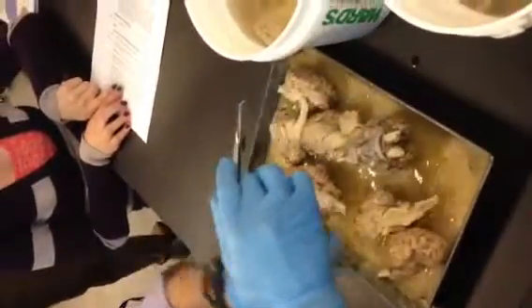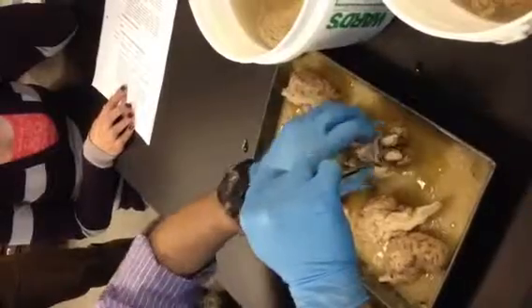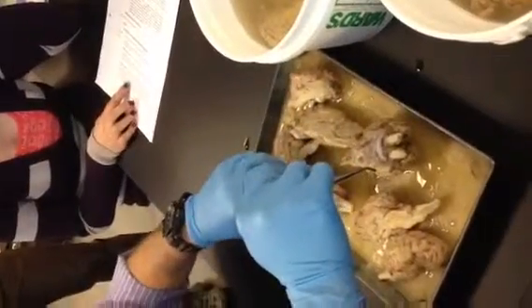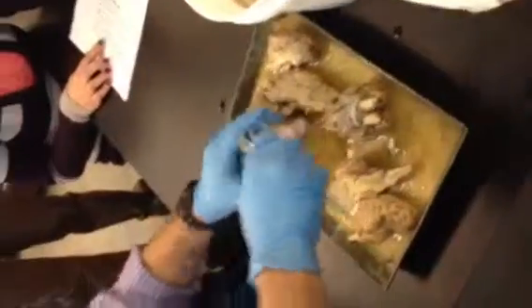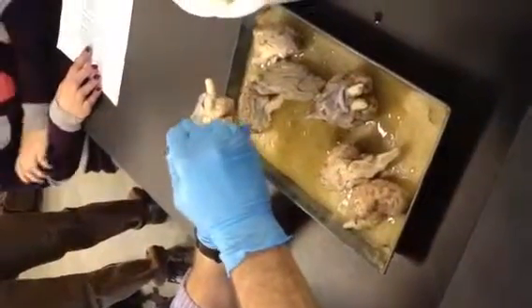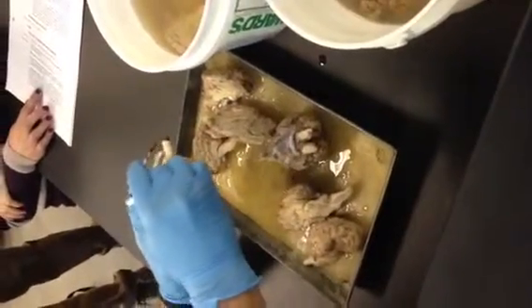And if we do the same thing from the underside of a sheep brain, that's a little bit better. Where do we get that one? Here now. This we can kind of peel away so you can see. Okay. Midbrain, there's the cerebral peduncles, pons, medulla, and then cord.